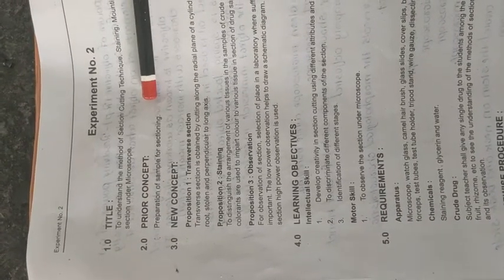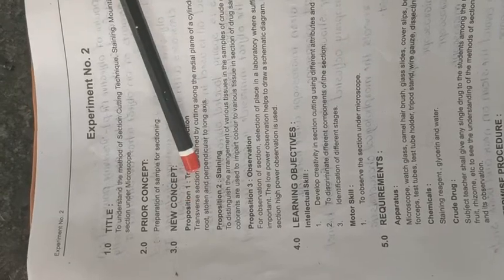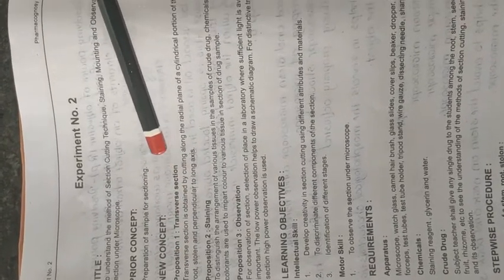Then preparation of the sample for sectioning, that is you have to prepare your sample for the sectioning. Then a new concept, the first one is the transverse section. A transverse section is obtained by cutting along the radial plane of the cylindrical portion of the stem, root, stolon and perpendicular to the long axis. This is nothing but the transverse section.